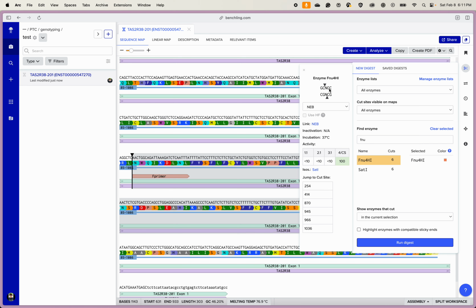So it's going to cut the wild type taster allele. Okay, so then also you can jump to cut sites, and now you can drop down and say, listen, I want a cut site anywhere in the sequence, anywhere in the current selection, or only in the current selection. And usually this thing is not really working well. So it must not be working well in other places because I see here that if anywhere in the sequence, right, you get 6. A lot of people put that for their homework answers, 6, right? And these are the 6.